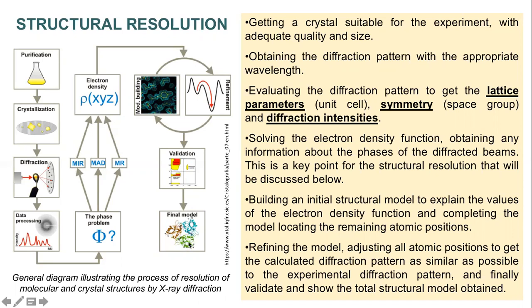So refining the model, adjusting all the atomic positions to get the calculated diffraction pattern as similar as possible to the experimental diffraction pattern, will help us finally validate and come to the total structural model of that particular compound. So, as I said, the structure is very important and very much related to the function of particularly the proteins.